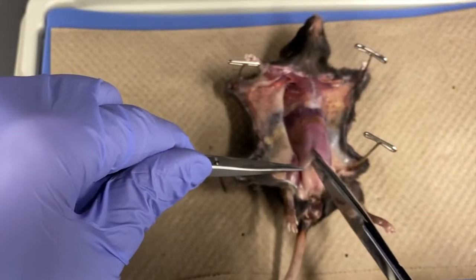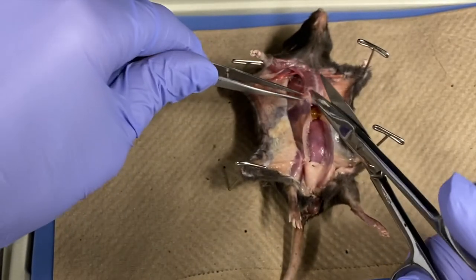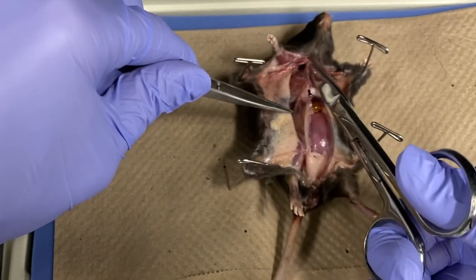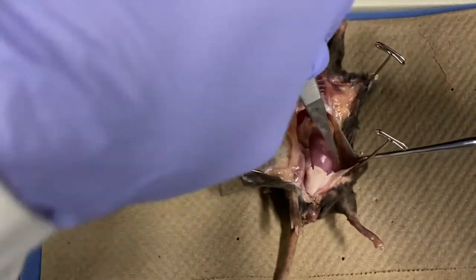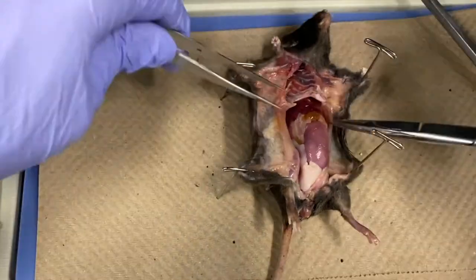Cut the muscular abdominal wall along the midline, just above the genital opening, and continue towards the head. This will allow you to see the organs of the abdominal cavity. Using forceps and a probe, as well as scissors if necessary, peel back the abdominal wall to separate it from the abdominal cavity.